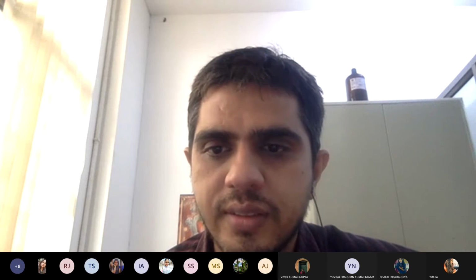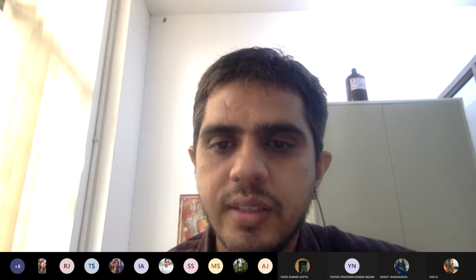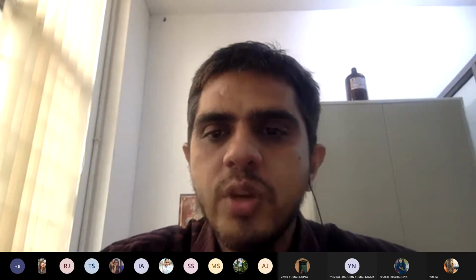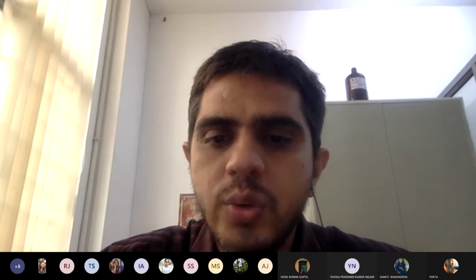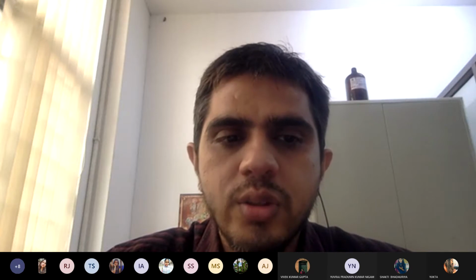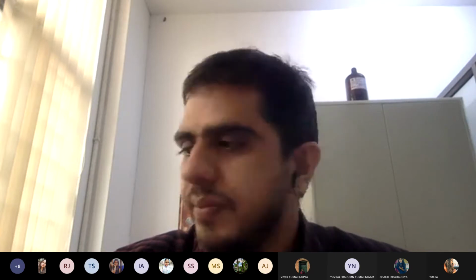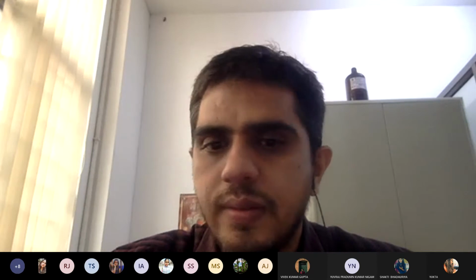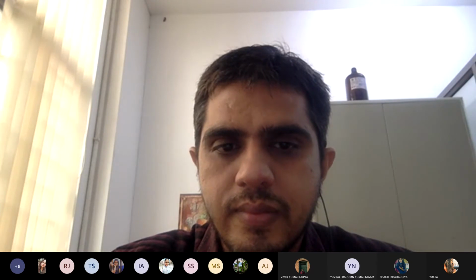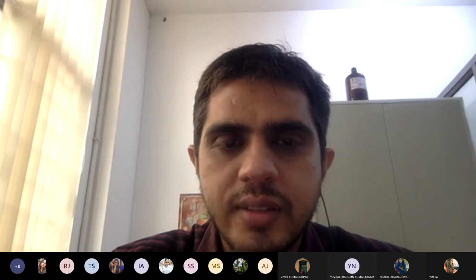Manaswini, Manaswini, yes. Tell me the purity of your sample when it is having absorbance 0.25 at 260 nanometer and 0.2 at 280 nanometer. And also turn on your camera. Manaswini, turn on your camera.